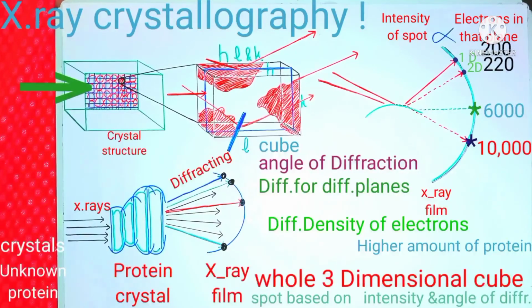So as far as we go with this protein, we will find high electron density present throughout this type of area, which is going to help us identify and understand where exactly the protein molecules and different atoms are present. But it is not the end, because it is going to give us an idea about where exactly the components are present. It is not going to give us the exact structure of the protein. So how could we get the exact structure?